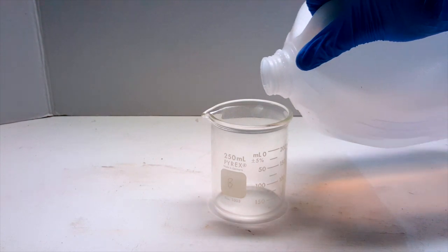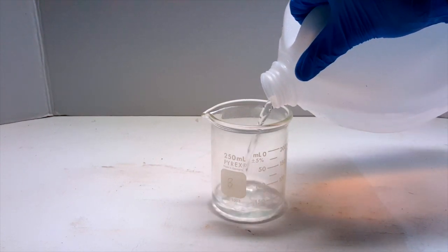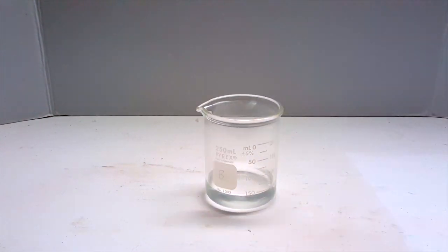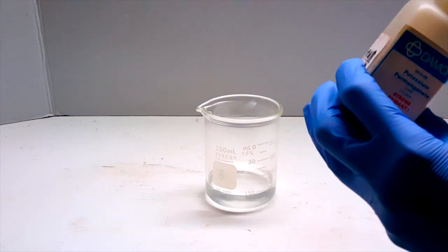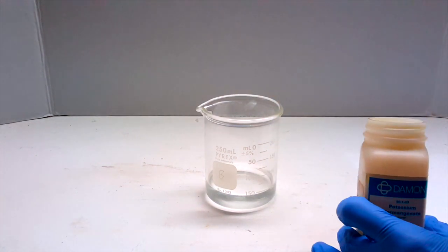Next, I take out a new beaker labeled B and add about 50 ml of distilled water. To this, I add a couple of milligrams of potassium permanganate and mixed it in.